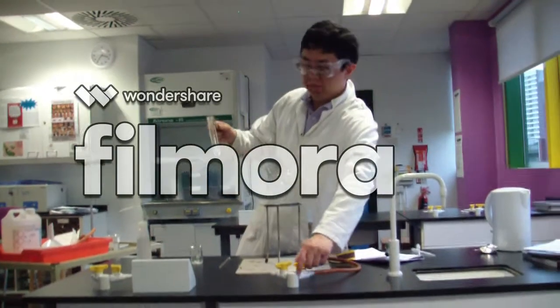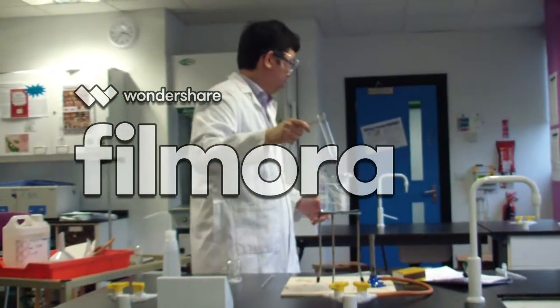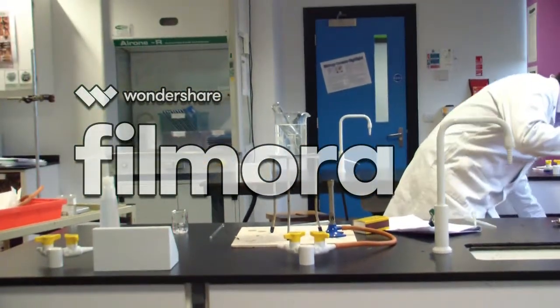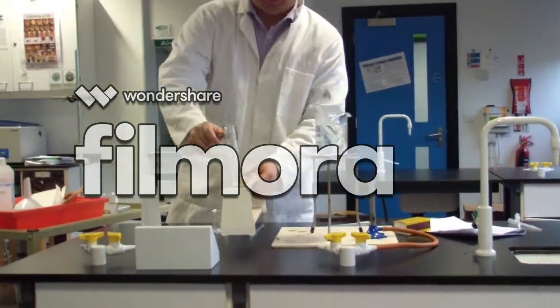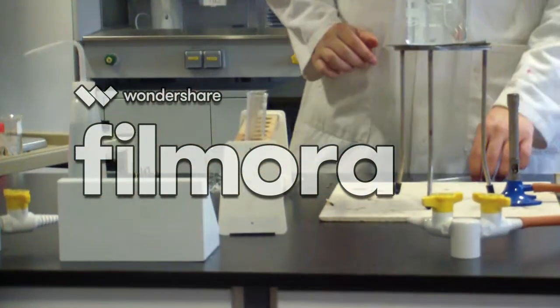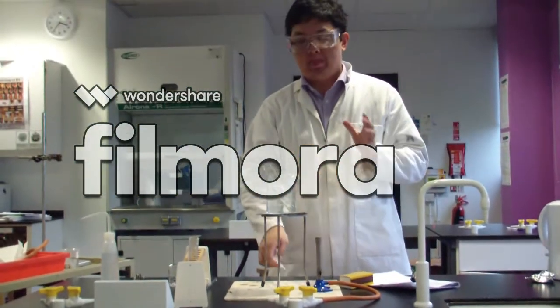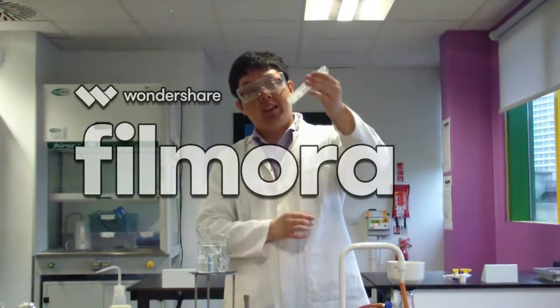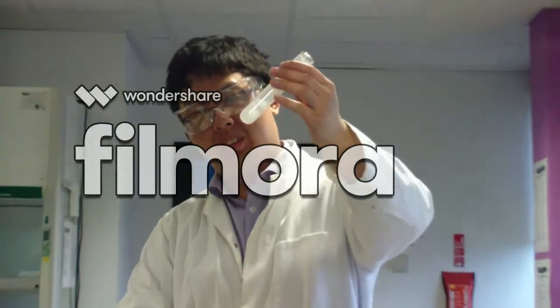Then we turn off the gas, and we wait for it to cool down. There you go. Now, if you want big crystals, you have to wait for it to cool down to room temperature in order to get the big crystals. Okay, left it to cool down, and now you can see the large crystals.